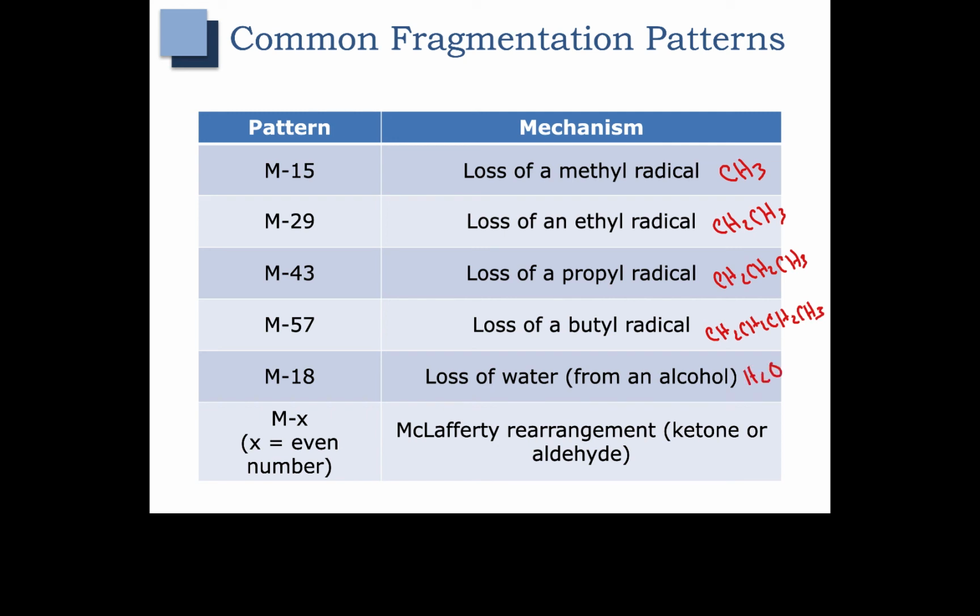M-18 is loss of water, and this is what we typically saw for alcohols. And then we also have our McLafferty rearrangement down here. It's hard to predict, obviously, because this depends on the particular molecule, but we see this commonly for ketones and aldehydes, and it's just M-X, where X is some sort of even number.